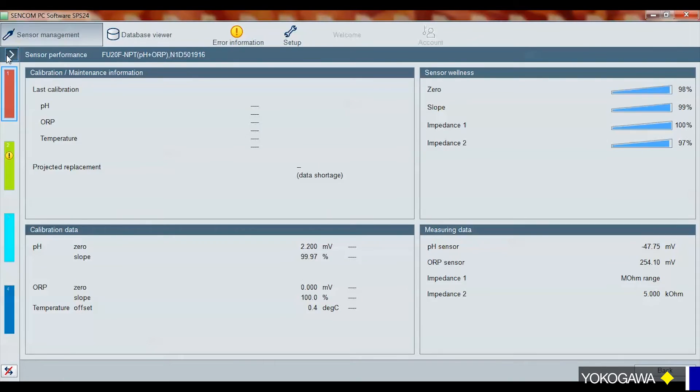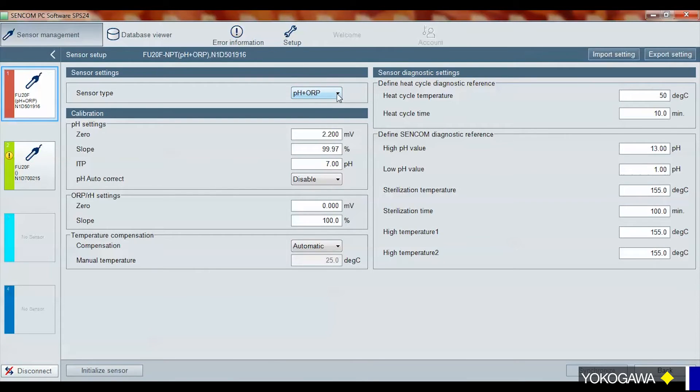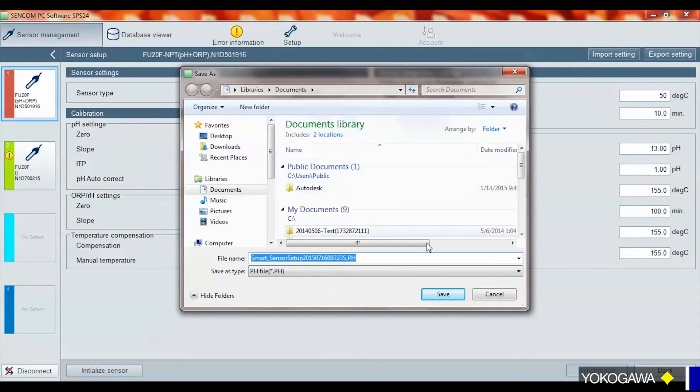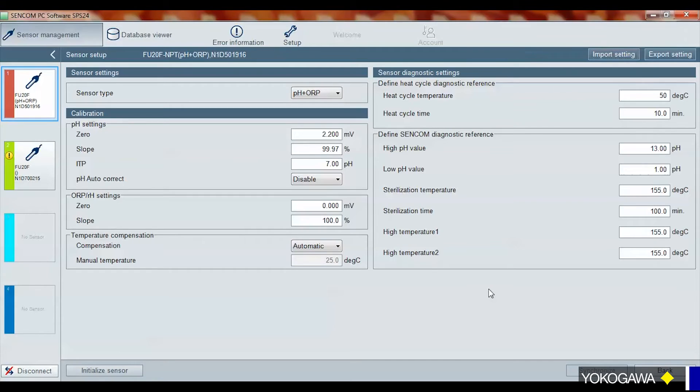One of the other features is you can configure your sensor right here at your PC. You can change it from a pH and ORP to just a pH or just an ORP value. What you can do is export these settings and save the file on your desktop. Then if you want to set up other sensors just like that one, you would connect the new sensor, import that file that you just saved, sync it to the sensor, and it allows you to easily reprogram and set up other sensors very quickly. These sensors also track your high and low pH values over their lifetime, how many steam sterilizations as well as high temperatures they've seen. So if your process runs normally up to about 80°C and the sensor fails, we can look and determine if it failed because the sensor saw an extreme temperature — whatever it may be.